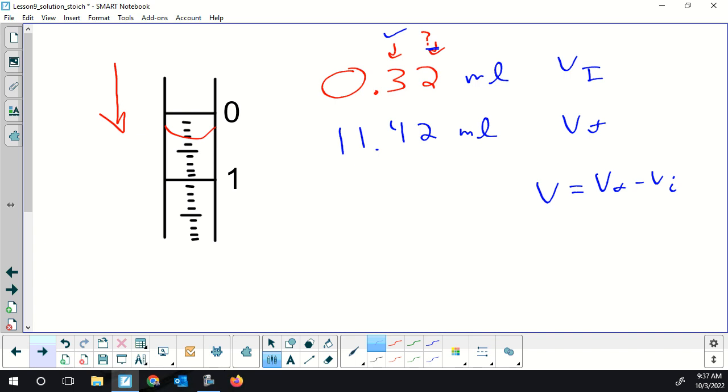Okay, so don't refill your burette after every experiment. Think, do I have enough volume in the burette to do another sample? Okay? And in this case, with the numbers I put up, that is 11.10 mils. So we would have absolutely enough room to do another roughly 11 mil experiment. Okay? We actually could do several more experiments. Okay? So we're going to go and do some math shortly with what the calculations look like with solution titration analysis.